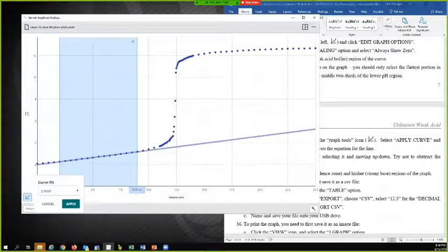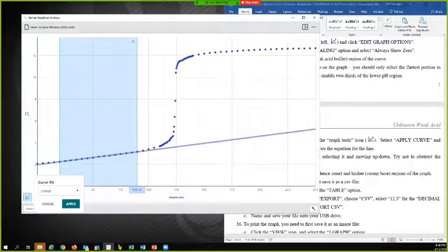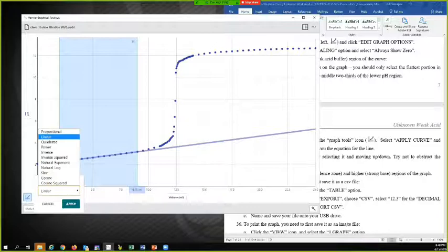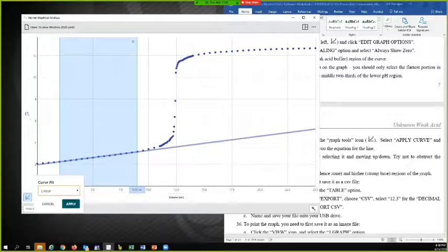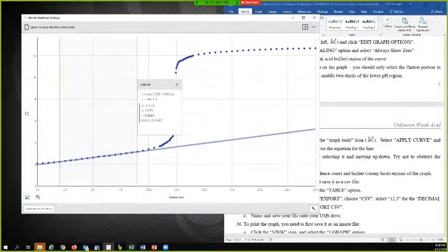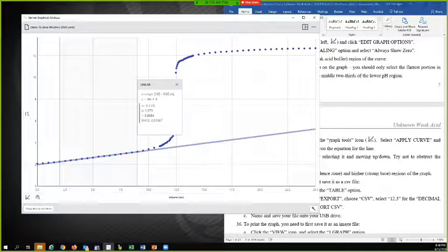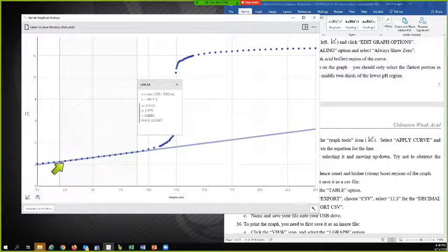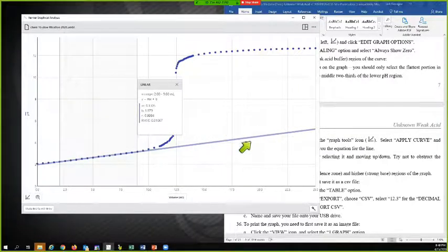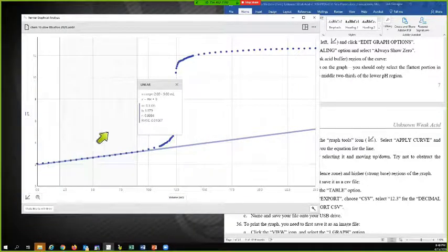Linear is the default. There's a pull down menu here, but I don't want any of those other things. I want Linear. And Apply. And so now we can see that it's done a linear regression line here.